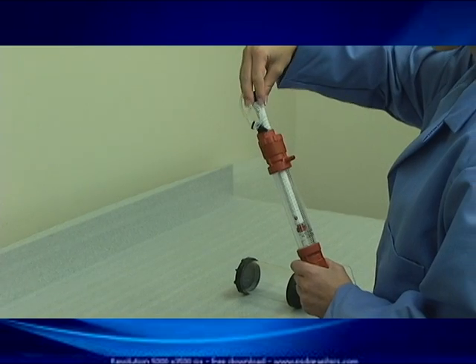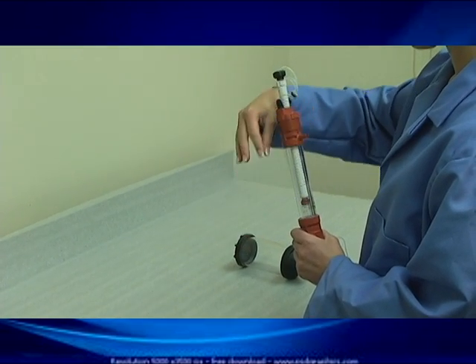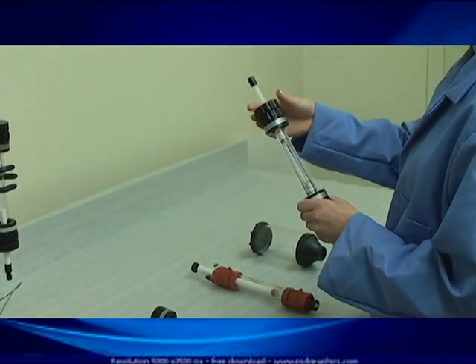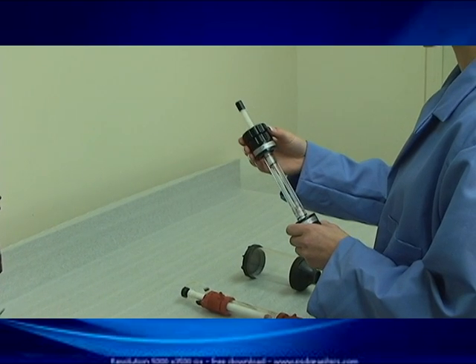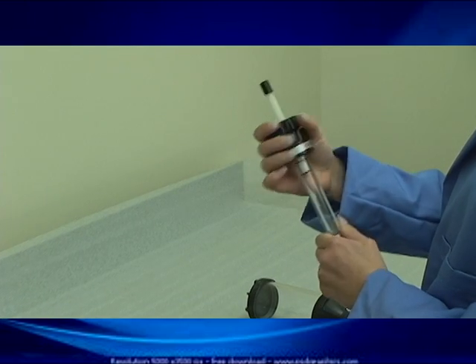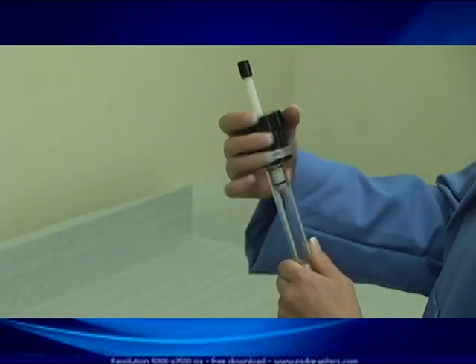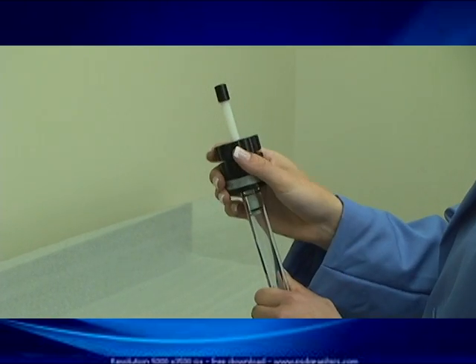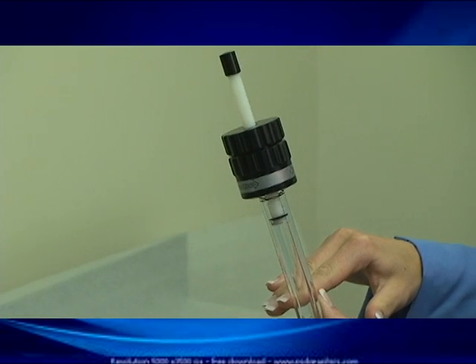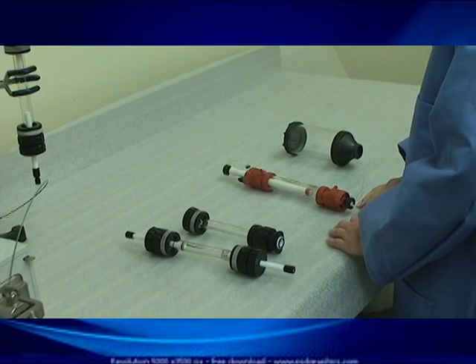Furthermore, if we decide to mechanically compress the bed, we are inducing a torsional load through the resin beads. On our Essential Life column, we have taken a different approach — we have chosen to turn the nut and not the screw. As the nut turns, the piston moves in a true axial fashion. As the piston comes down on the packed bed, we compress the bed in a true axial fashion without disturbing the bead bed. We believe this gives much better chromatography and is the most important feature of our product.